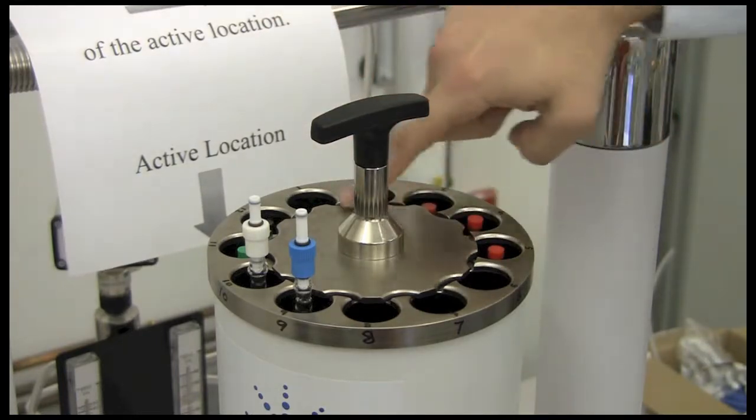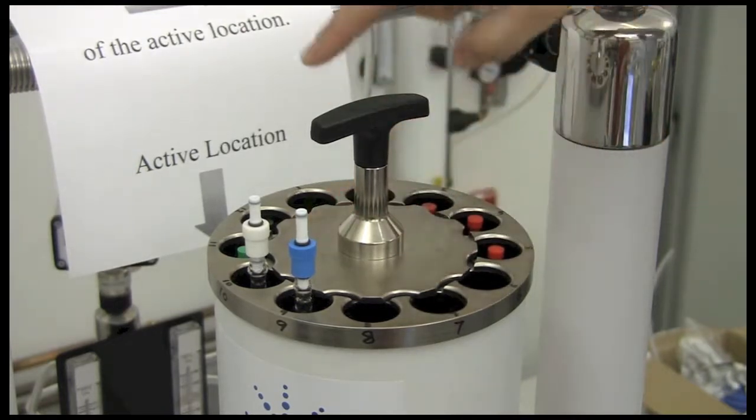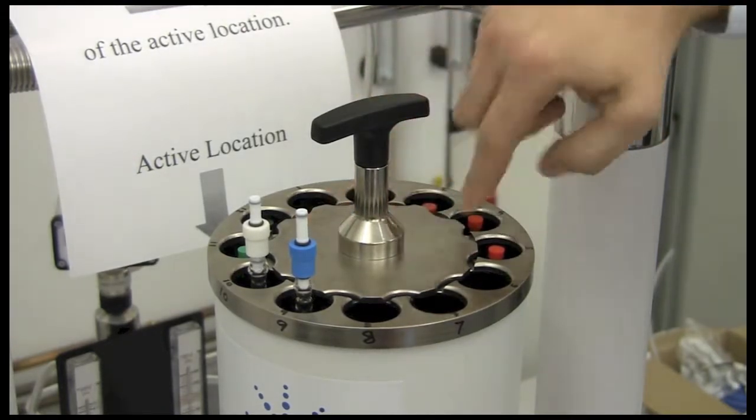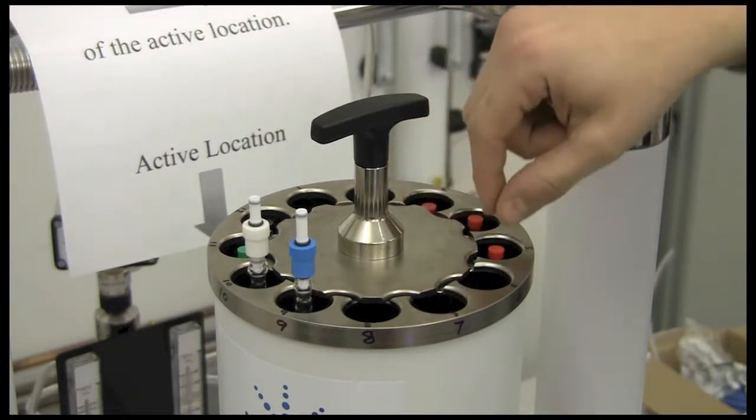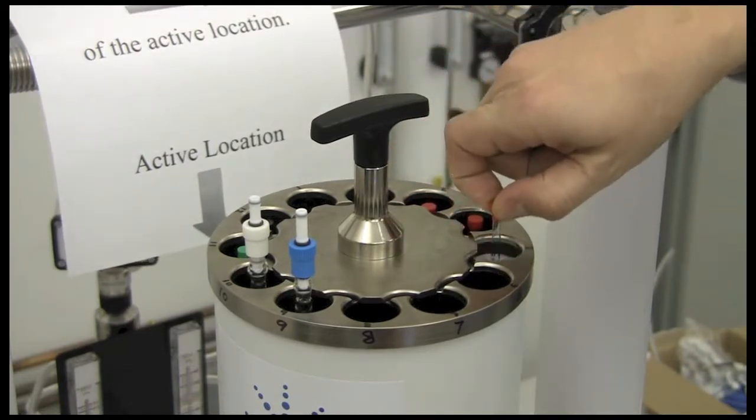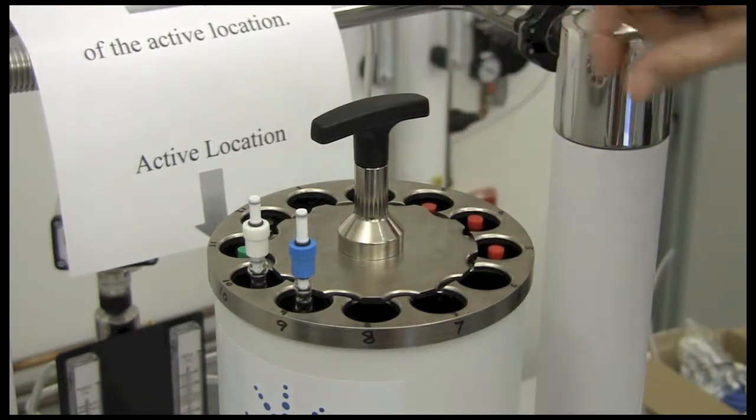You can also notice that there is this central thing with the handle. This is the capture handle, and normally it should be in the capture position, which prevents the sample from coming out of the sample changer carousel.